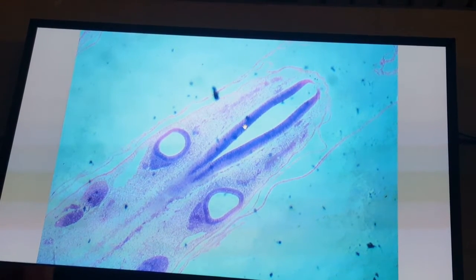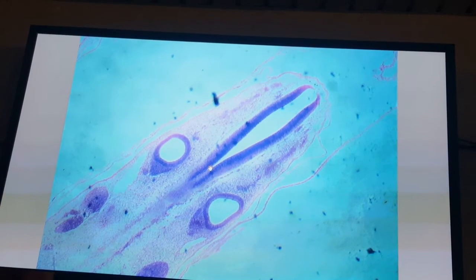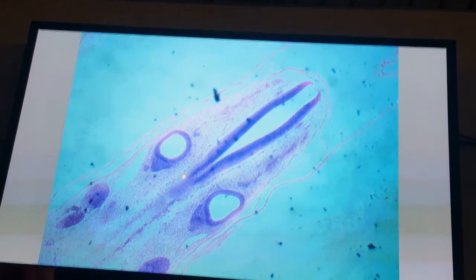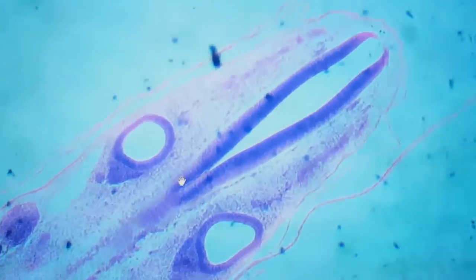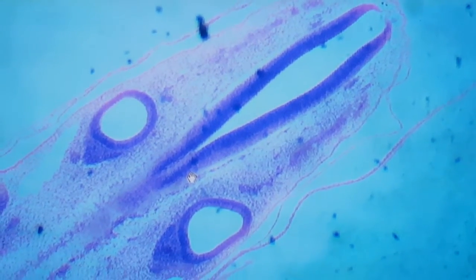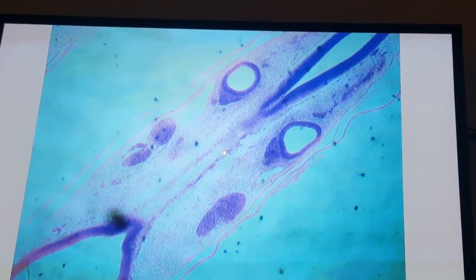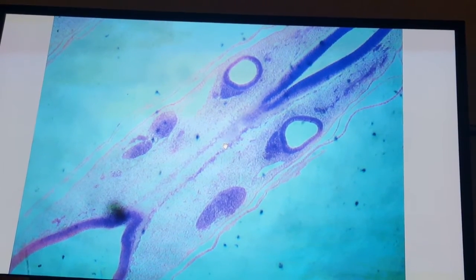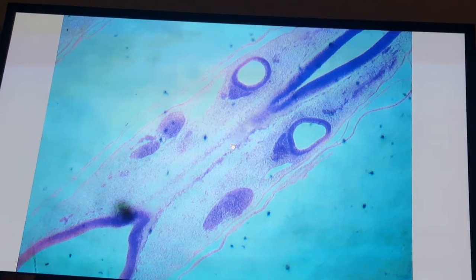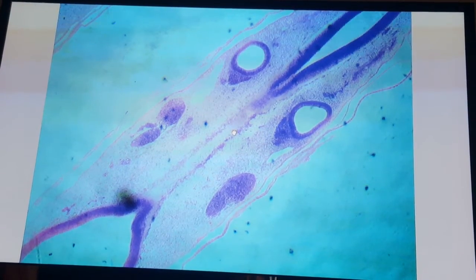In both parts, the myelencephalon and the diencephalon, we can see the layers: the neuroepithelium, the mantle zone, and then the pink color, which is the marginal zone. So neuroepithelium, mantle, and the pink is marginal. Also, you can see that between the myelencephalon on that side and diencephalon on that side, this is a section into the notochord. So this is the area of the cephalic transverse section in the folded anterior C-shaped part of the embryo.